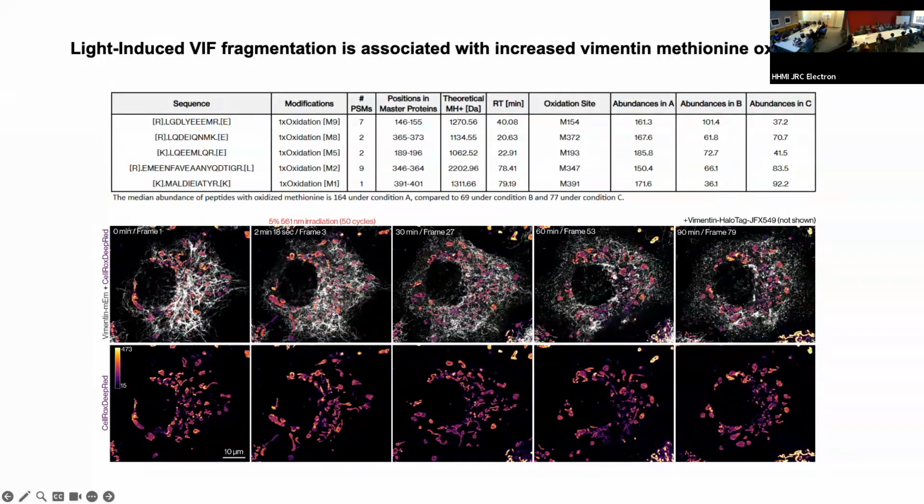But I can also say, if you use JF570 or JF634 and you keep imaging your cell, you absolutely will see phototoxic effects on everything. So calculating empirically in your system the energy dose required to get this effect, and using safe mode instead of FilaBuster mode when you can, is critical.